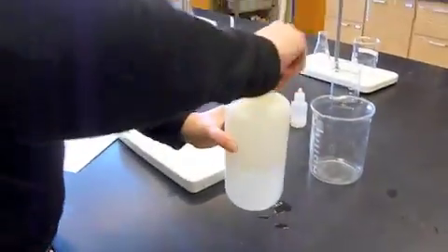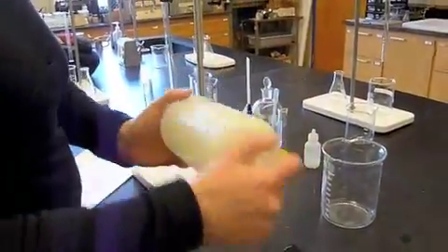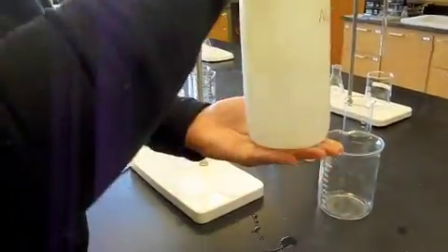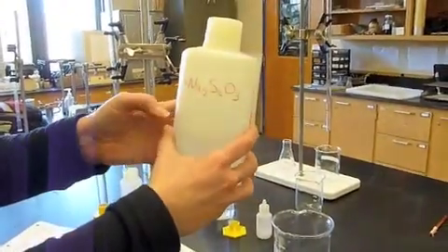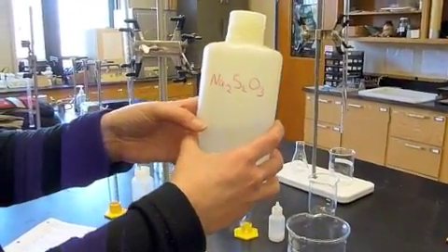We should have probably put it in the bottle and inverted the bottle to do it, but you wouldn't have seen how it dissolves as well because the bottle is opaque. We've labeled the bottle so that we know that it's not water.